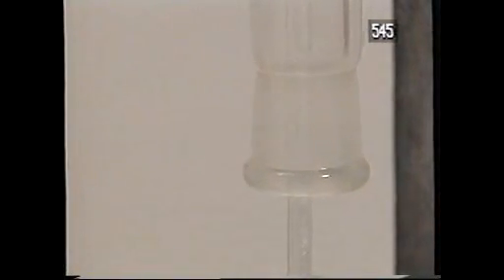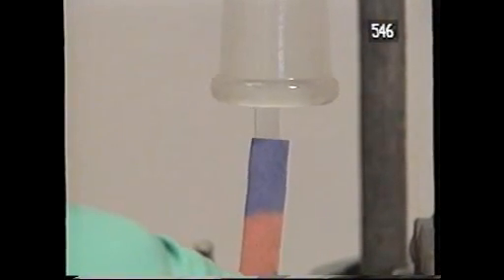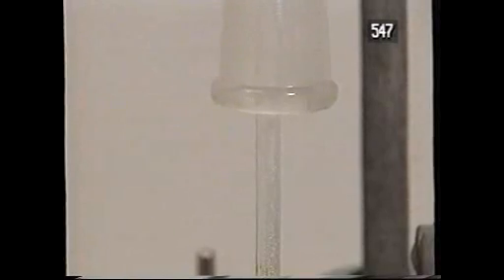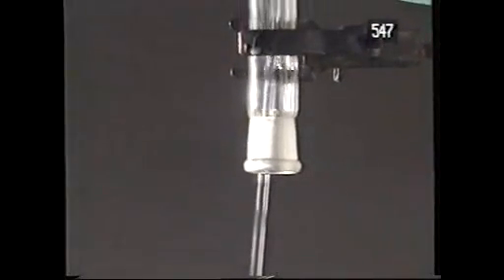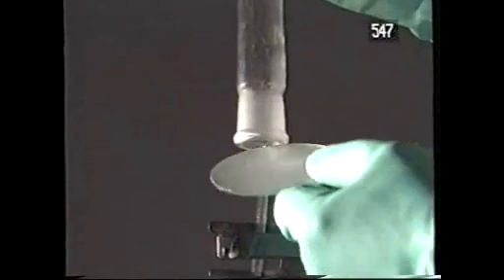Let's go back to where the ammonia is being collected. I put a piece of red litmus paper at the mouth of the tube. It instantly turns blue. Ammonia is an alkaline gas. Ammonia is less dense than air. It pushes the air downwards out of the tube. I'll just put a cover on the tube and take it away.